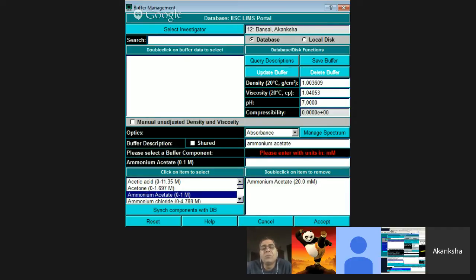So this is from here, and it sounds almost like you still have some network connection issue over there. If you look at my screen for a second, when you set up your database, make sure that these details are entered correctly. It almost sounds like there may be a connection error, or maybe some of the details, the password or whatever, are not correctly set up. You might want to close the application completely and start it up again and see if it works then. If you continue to have problems, send me an email offline and we'll take another look at that, okay? Yeah, thanks.